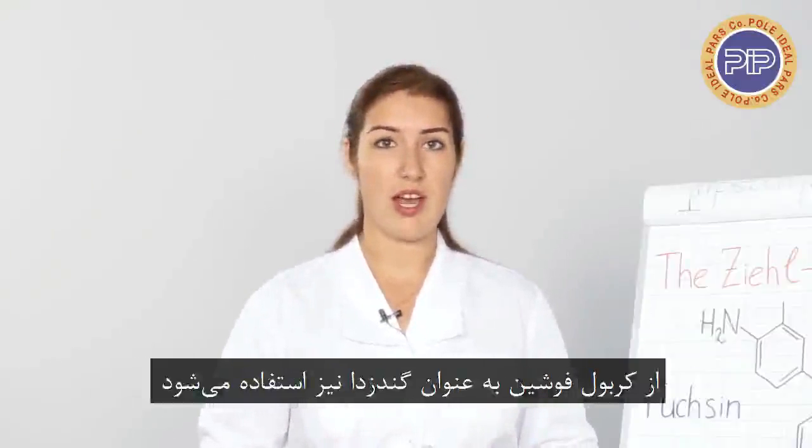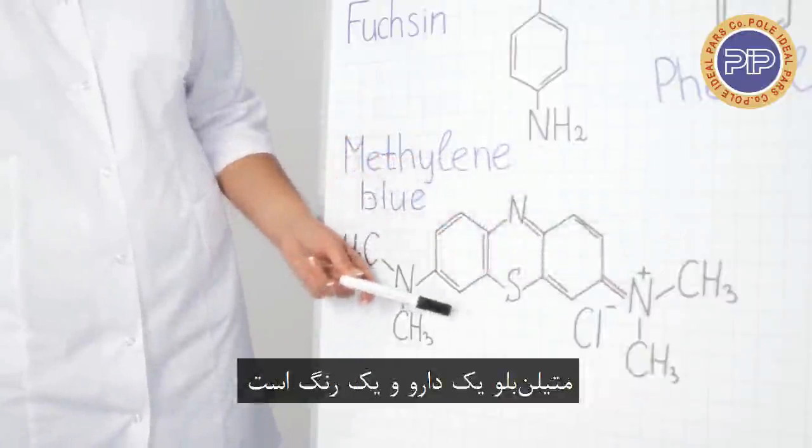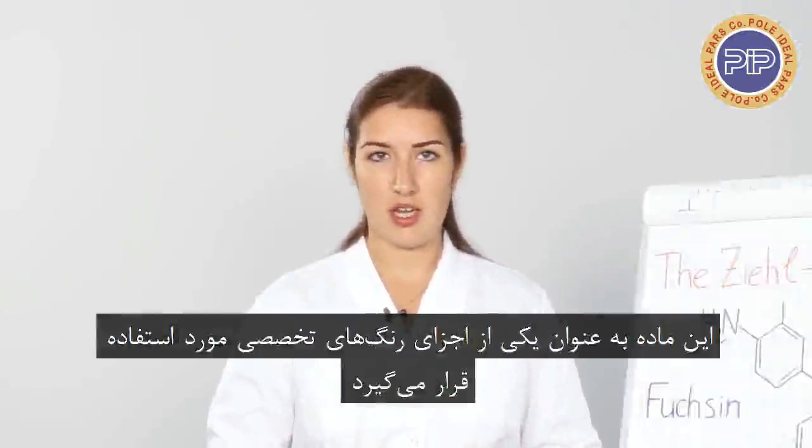Carbofuchsin is also used as an antiseptic. Methylene blue is a medication and a dye. As a dye, it is used as a component of many special stains.